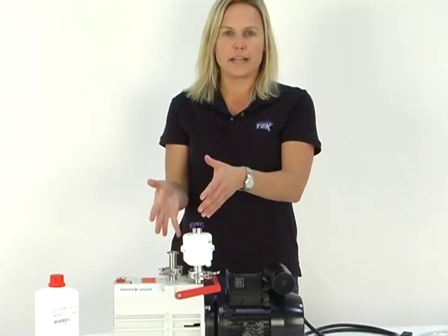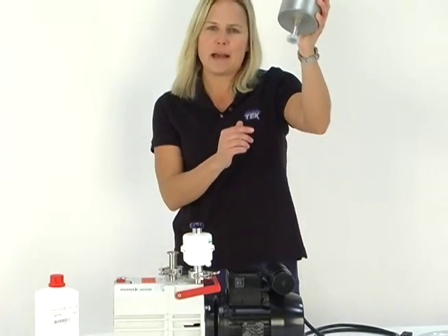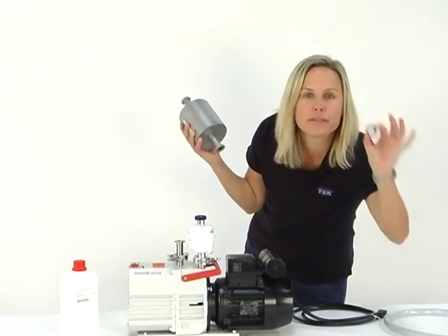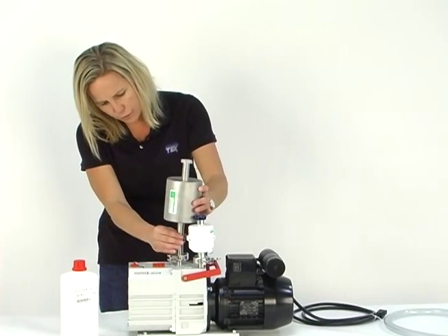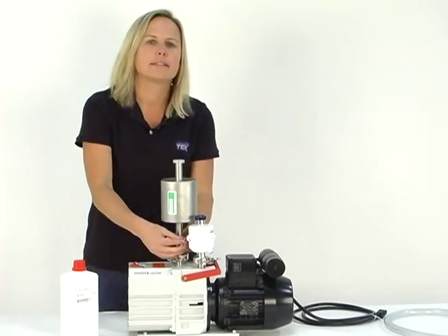Now you're ready to mount the foreline trap onto the inlet. This is the foreline trap — remove the plastic cap. Now we have to grab what's called a centering ring, one of these little guys. Seat that right there on top of the spacer, put your foreline trap right on top of there, and tighten.